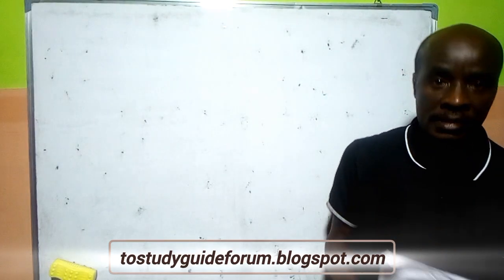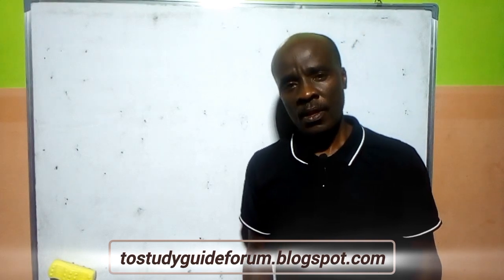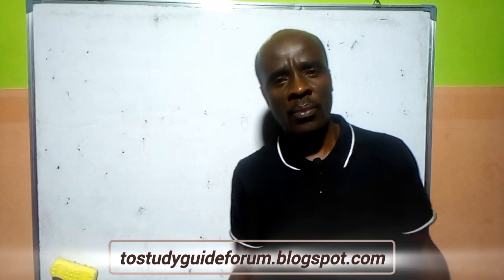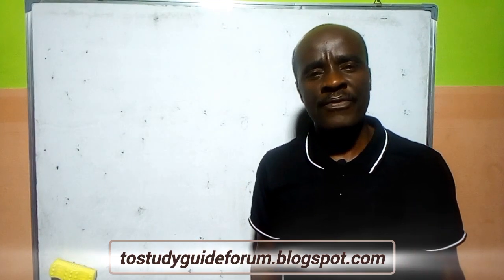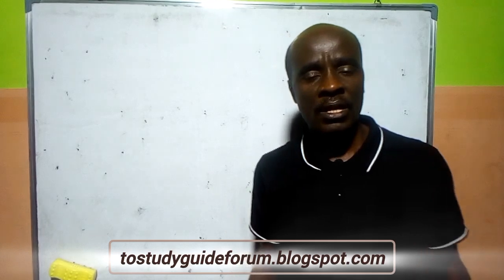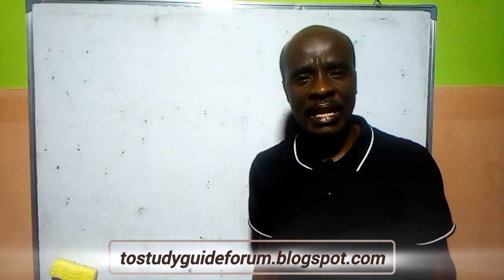Today we'll be looking at the specimen for this year's exam. And before we go into that, I want to address some questions I've been receiving from my Facebook page in regards to how to really deal with ions, the salt analysis. That's what I want to do today. I want to look at the salt analysis.